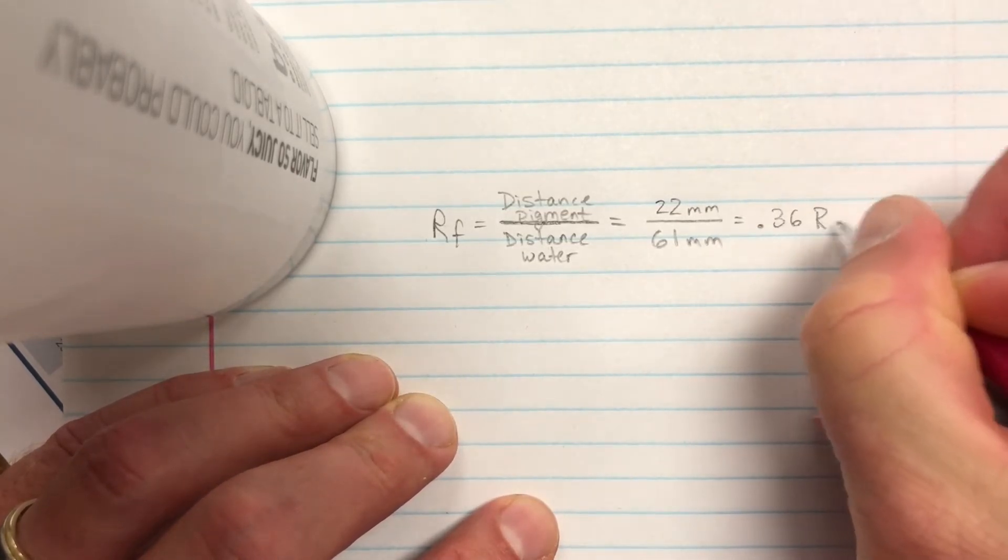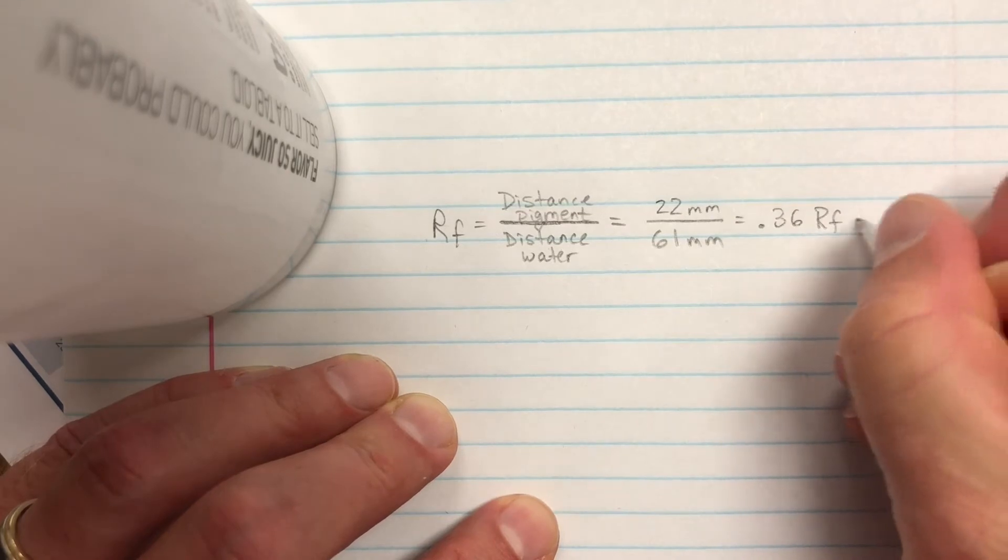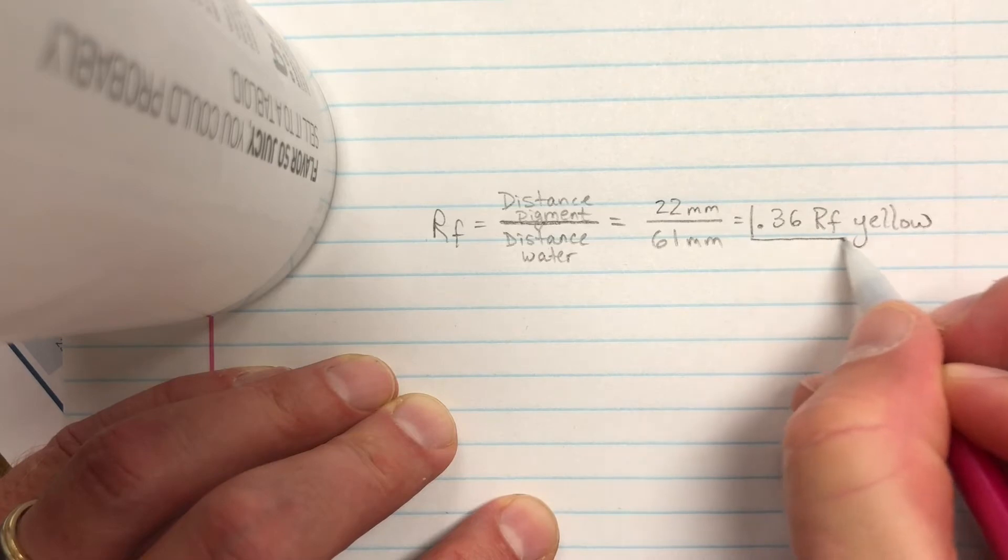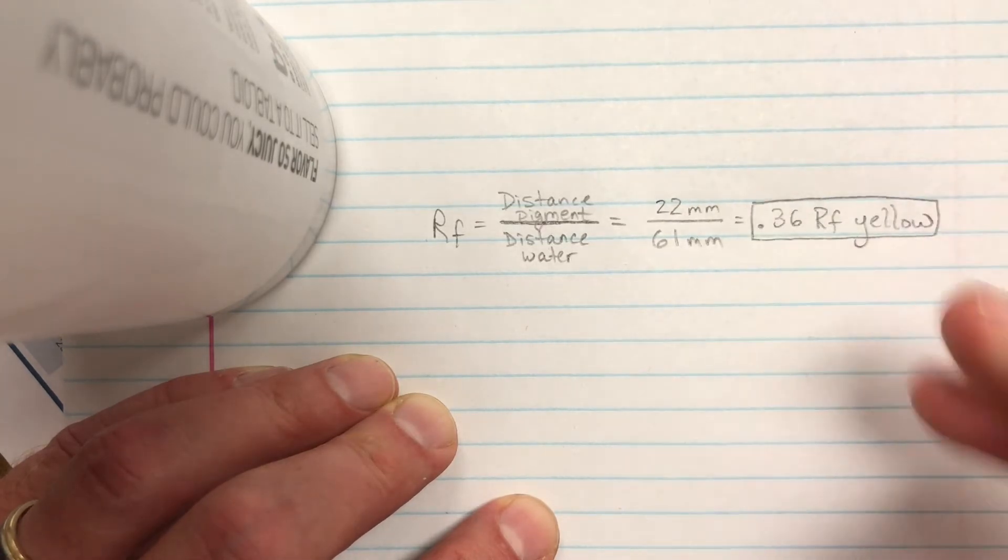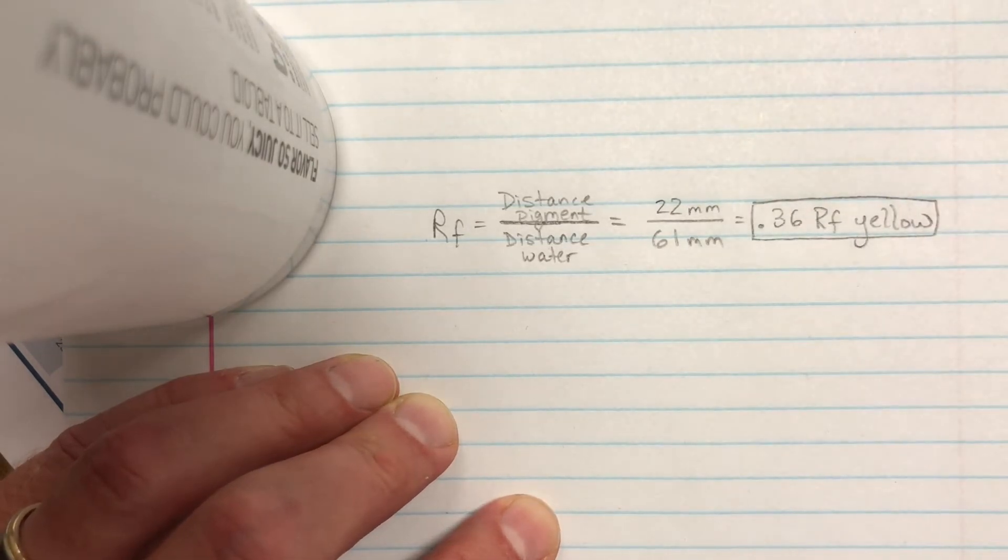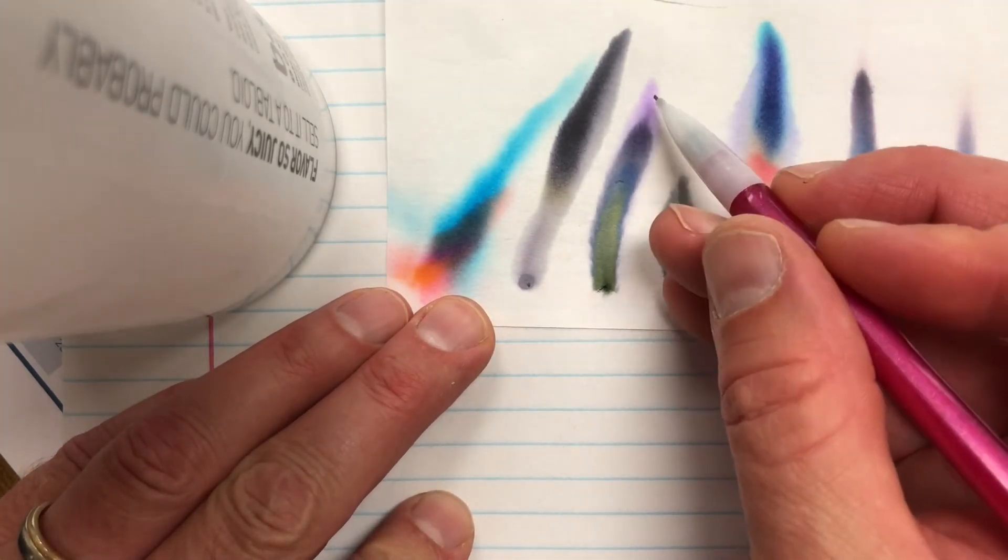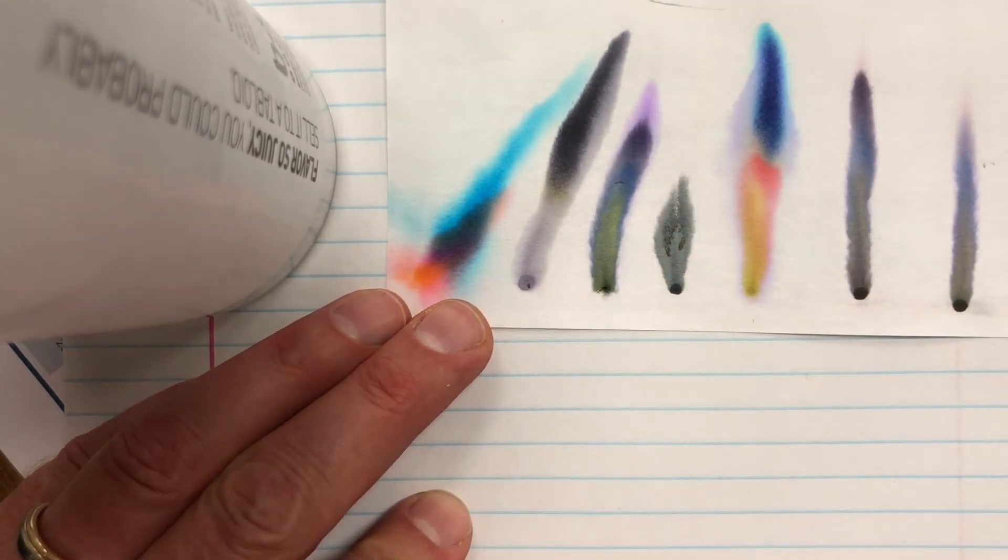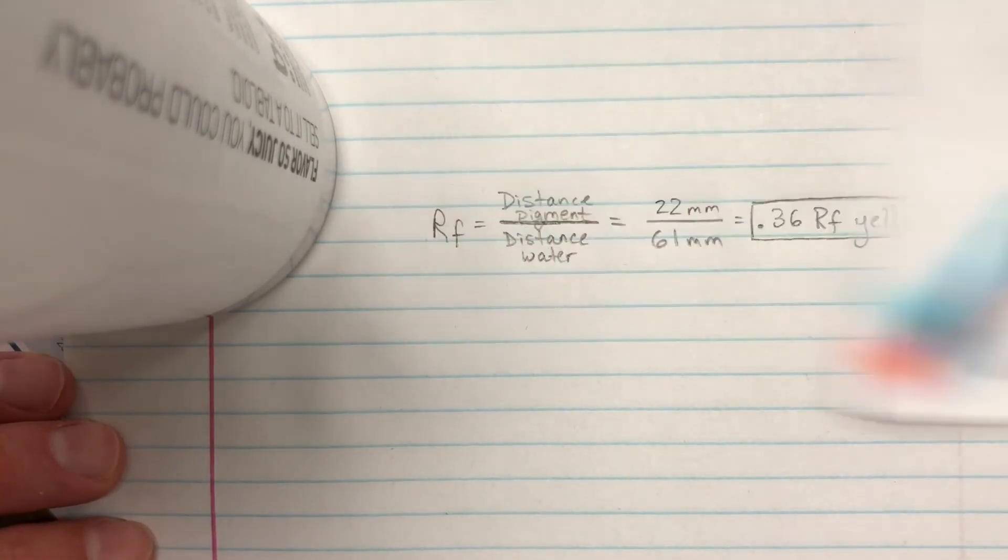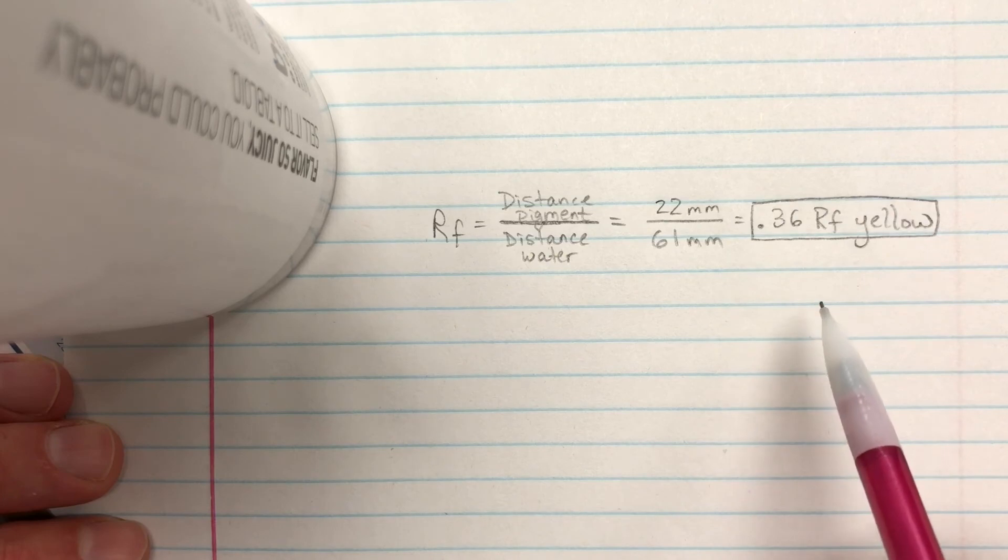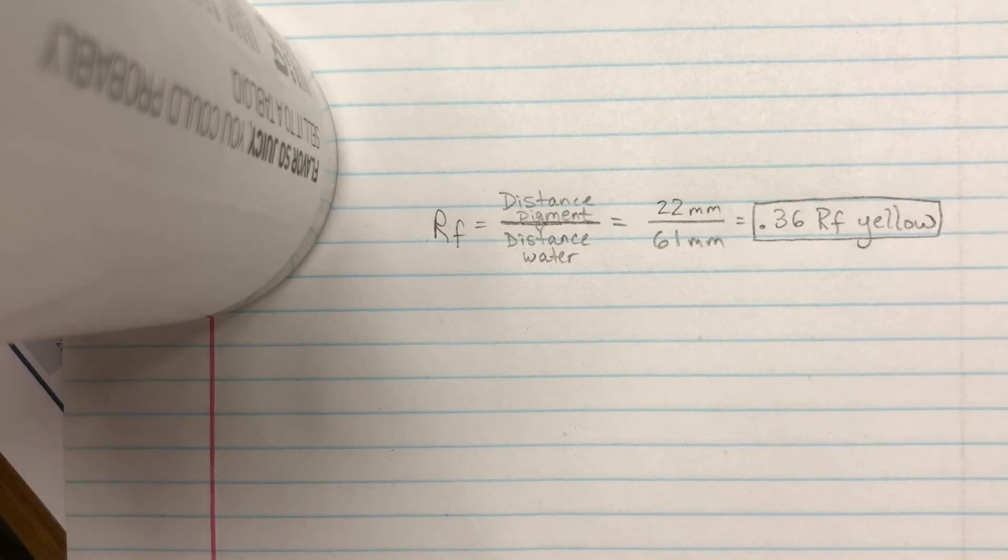And I want to do the same thing for the blue, the dark purple, and the purple, at least for this sample right here. Okay, so I hope that helps, and tomorrow I'll see you with the different color RF values that you have for the two samples that you brought home. Okay, have a great night, bye.